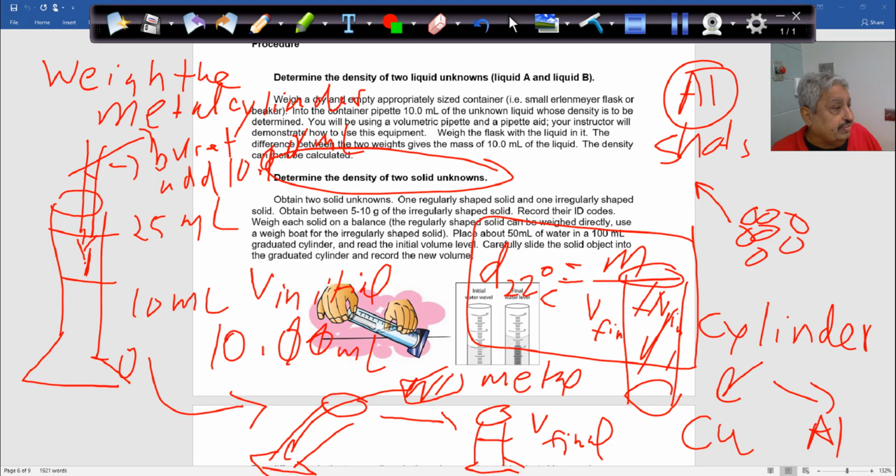Any question about this? That's the displacement method. We'll do just the displacement method. We'll not use the vernier to measure the cylinder dimensions, the radius, or determine the height or the length of the cylinder, like we did before in the last experiment. And even this is very difficult, because the shots are not spheres. They are crooked, really crooked spheres. There's not really a sphere per se. So those are the two ones. Everybody's following?